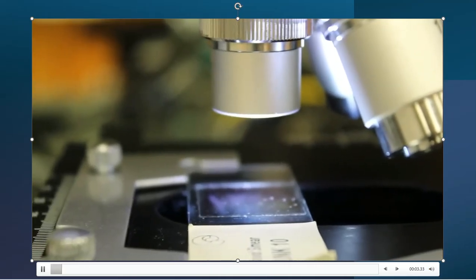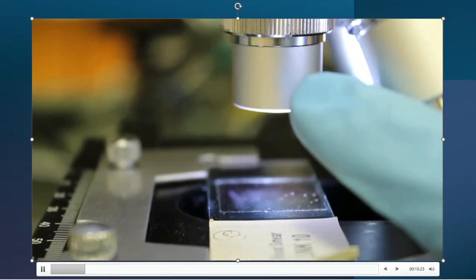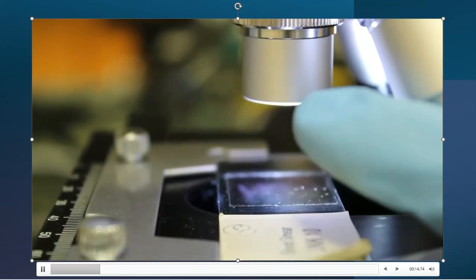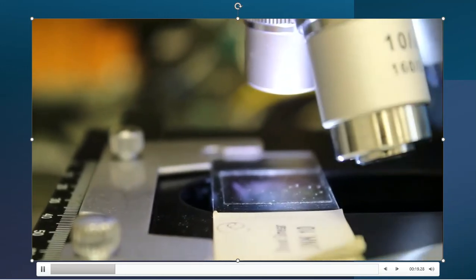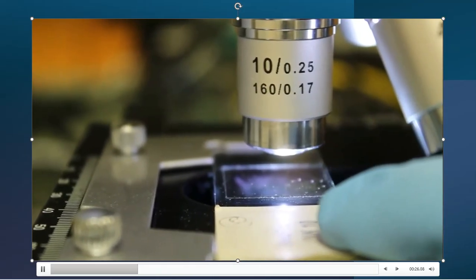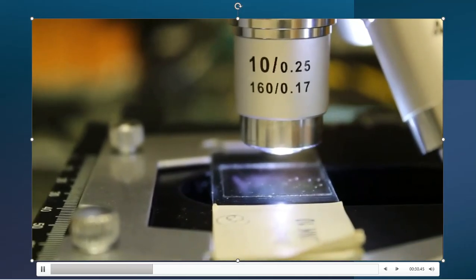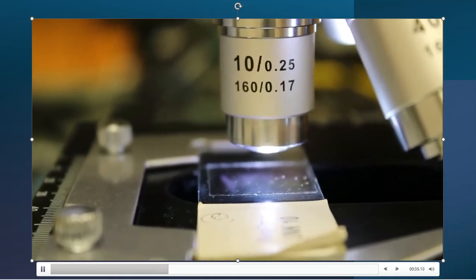Okay, so I want to change the turret so that way you can see this a little bit closer above the microscope slide. So this is the 4 power, and there's the slide at the very bottom, and you can see how much space is actually between these two. When I turn the turret to the next magnifying power, that's going to be our 10, you will see that that lens gets way closer to the slide down below, so you've got to be careful. So at this moment, I know that my next magnifying power is going to be a little bit longer.